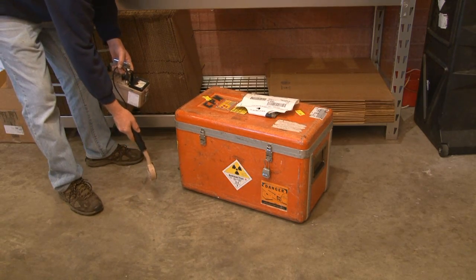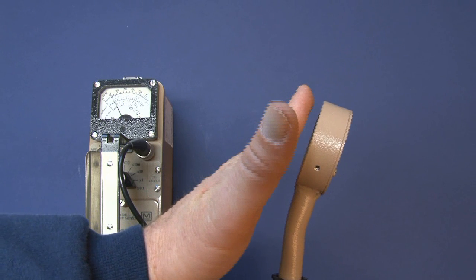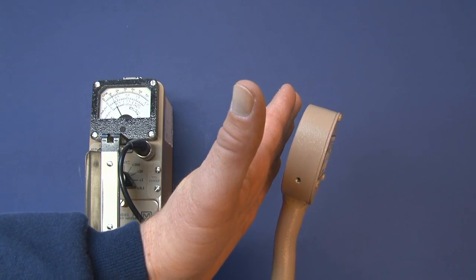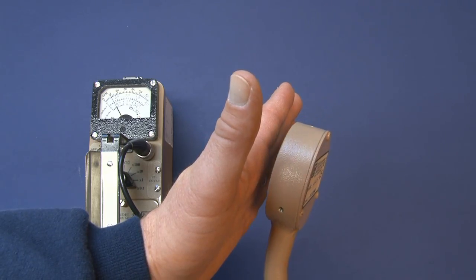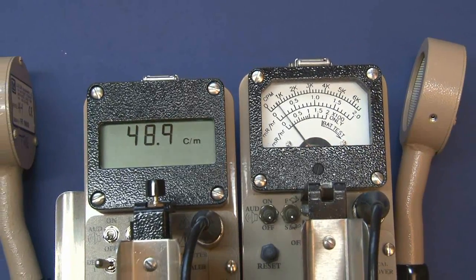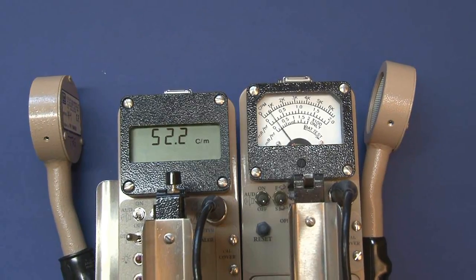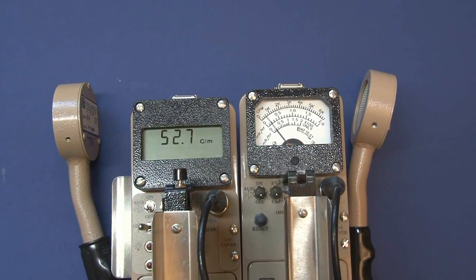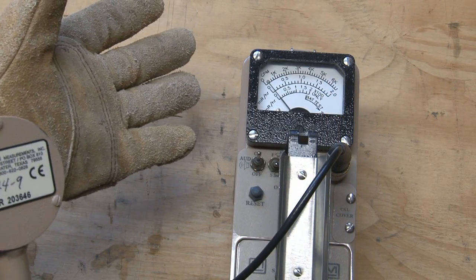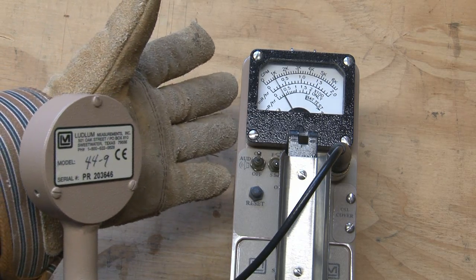To use this detector for what it's ideally suited for — which is contamination monitoring — the probe should be held about a half inch away from the surface you're surveying and moved about one to two inches per second. Typical background with this type of detector is going to be about 50 counts per minute (CPM). While you're surveying, you want to listen to the audible count rate and pause any time you hear an increase above background to make sure you give the instrument adequate time to respond.